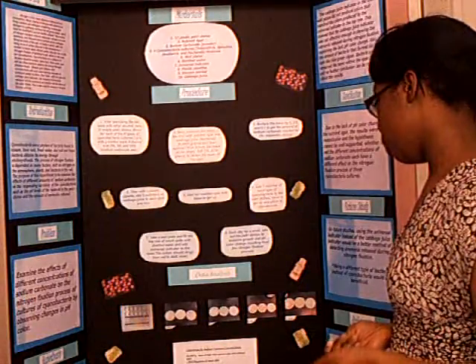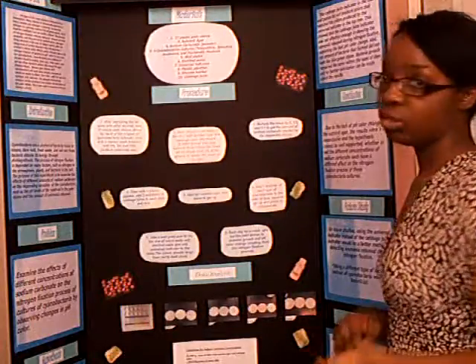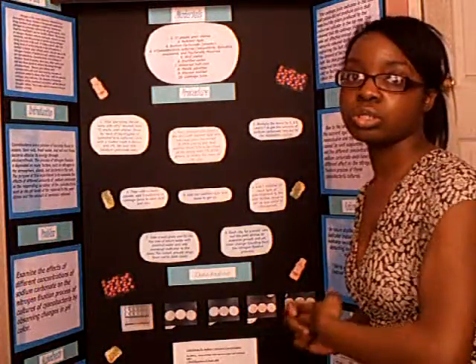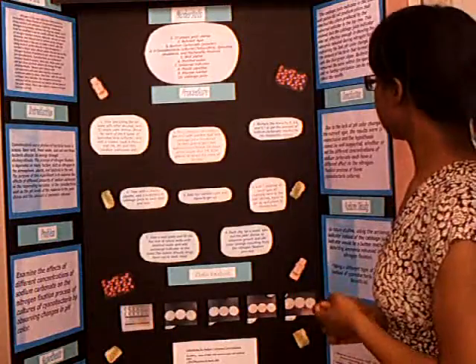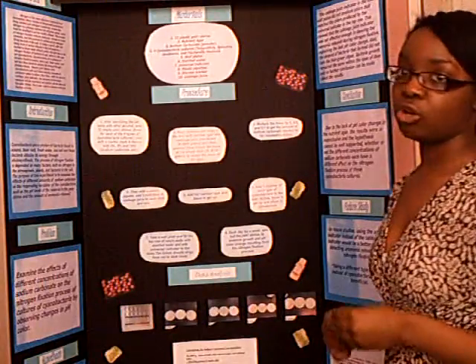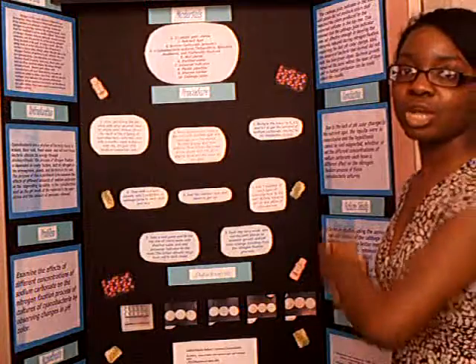The cabbage juice indicator, when poured in the microwells, did not match the pH colors shown by the universal indicator. So in my future studies, I would use a universal indicator in order to observe the pH color change. And I would also try to use a different type of bacteria instead of cyanobacteria, and I would hope that it would be beneficial. So that is my project.